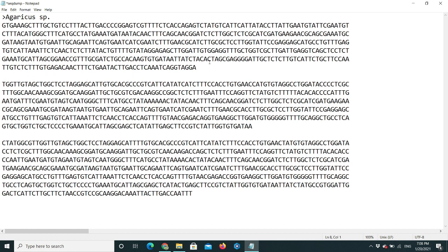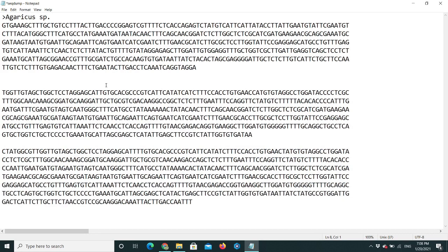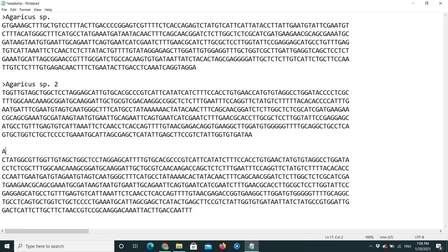Let's do it for the second and third sequences as well. We have prepared the FASTA files — don't forget to insert the greater-than sign, that is very important. So now we have three sequences in FASTA format.